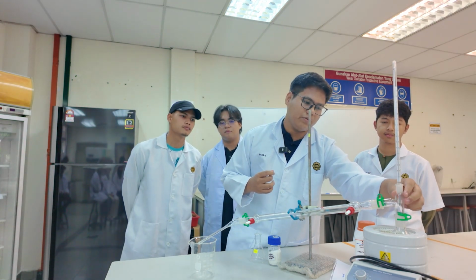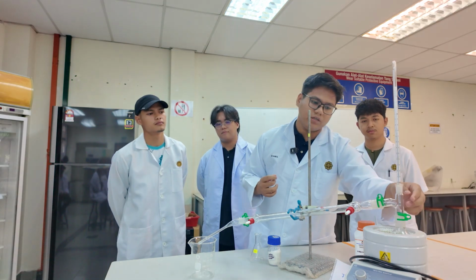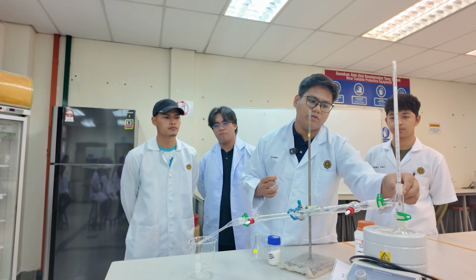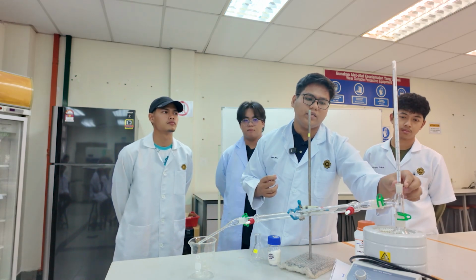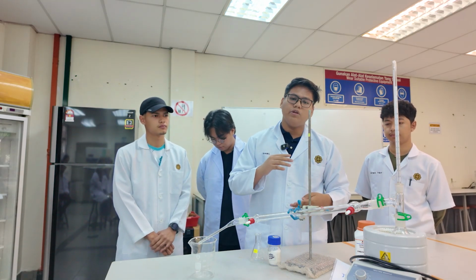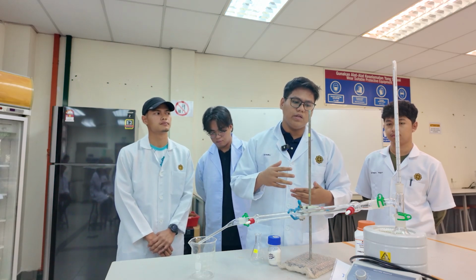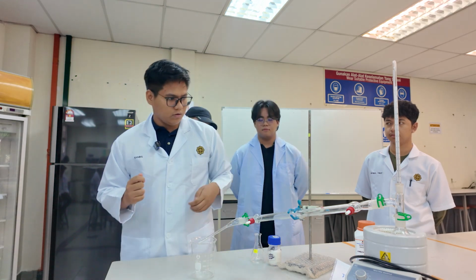This distillation head will direct the vapor to the condenser, and also direct the vapor to touch the thermometer, so that we can determine the temperature of the vapor, so that we can keep the temperature under the boiling point of the other liquid that we don't want to vaporize.